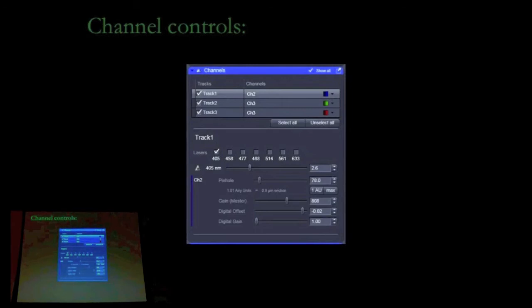But yeah, you basically have a light budget. You have a certain number of fluorophores in your sample. Exposing them to intense laser light is going to lead to losses of those at some bleaching rate, and you have to parcel out how it is that you're collecting them. So how you decide to set the gains, the things that guide you, are going to be different if you have a fixed sample versus a live sample that you want to image over time, or something that you want to take Z-stacks with versus just a single plane.